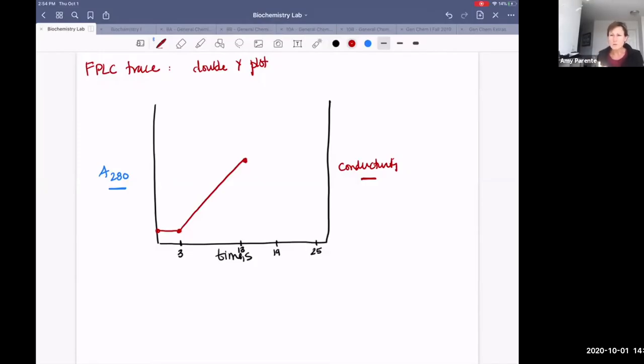You go up to 100% B right away. So I'm going to jump up to super salty and I'm going to stay there for the next 6 minutes. And then I said, you know what? Let's go back to no salt and do it quickly and then stay like that to the end.